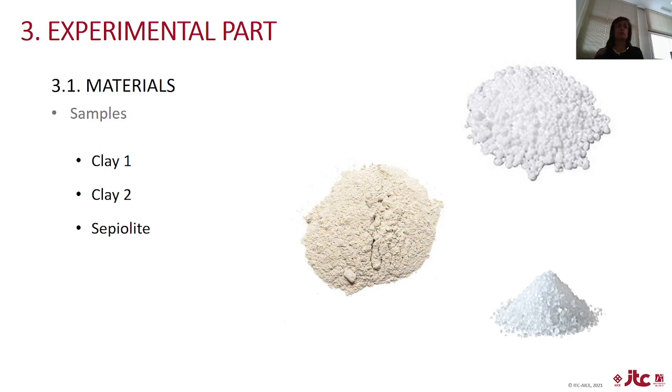Several samples from different suppliers of geological raw materials were selected to be able to carry out the present study. Exactly 2 clays and a sepiolite, apart from the corresponding certified reference materials used.